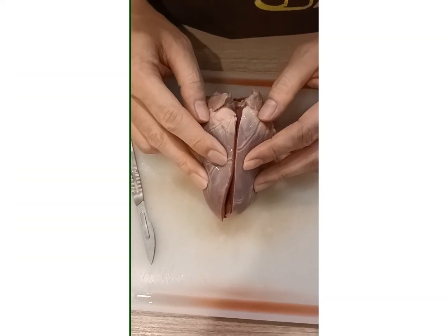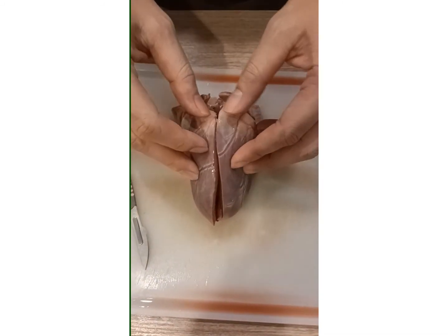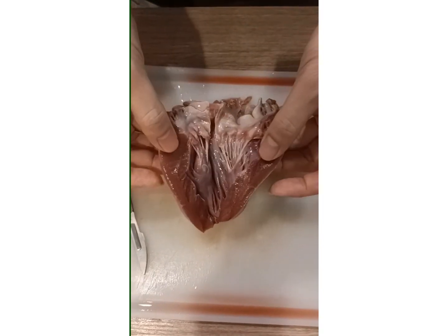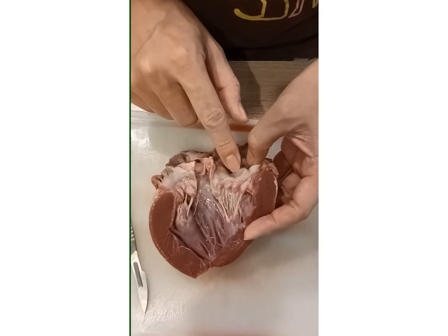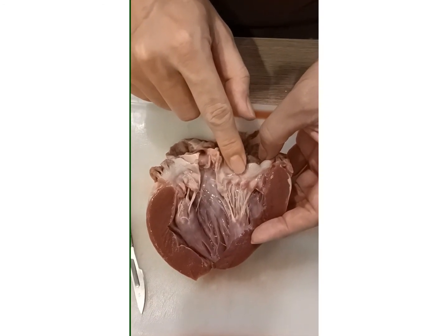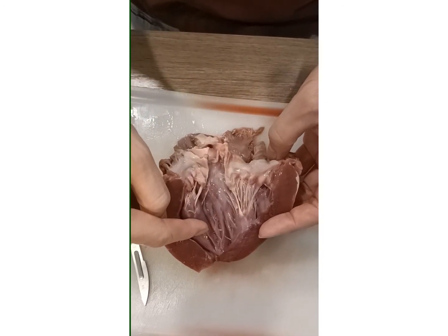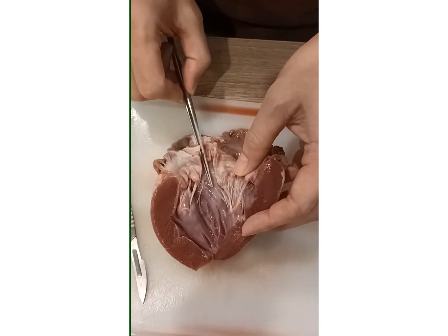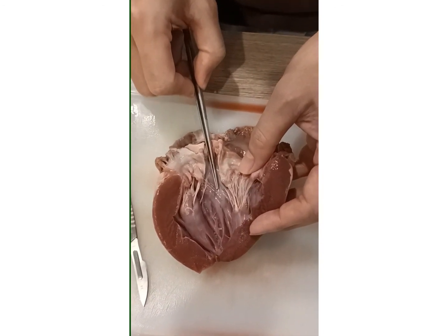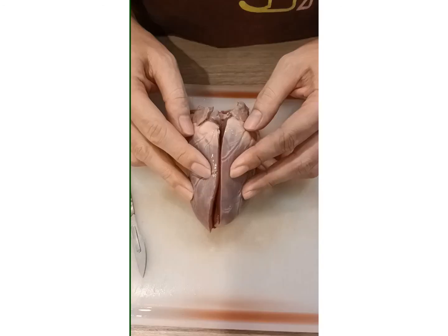Now we're going to cut through the left ventricle. You cut through the middle of the ventricle and then you open it. So what you can see now is this. This is the left atrium, which collects the blood from the pulmonary vein, and this is the left ventricle, and this is the AV valve, and this is the aorta, which collects the blood from the left ventricle, and this is the aortic valve.